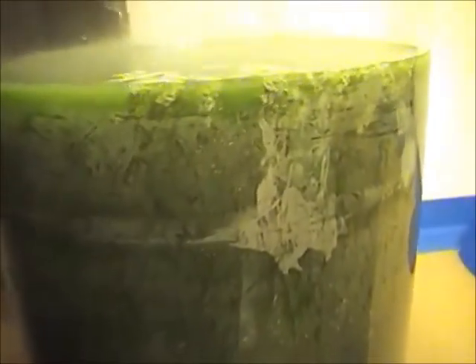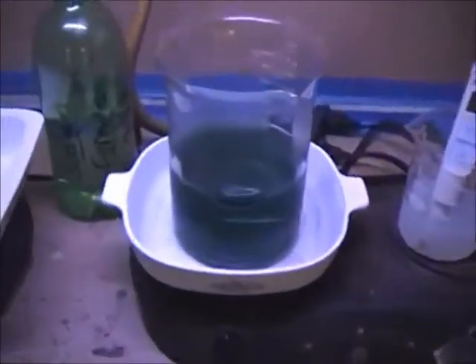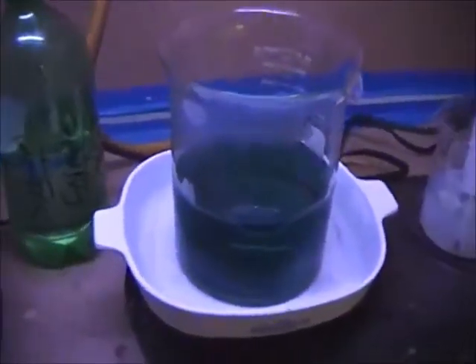If you'll look, it even precipitated on the beaker, just like it does with gold sometimes. Let's see if we can get a little bit of a zoom in here. You can still see it rising and falling, but the precipitation step is pretty much done now. That's just coming from the gas. So let's go over here and let me show you again what this looks like. You can see our clarity here.